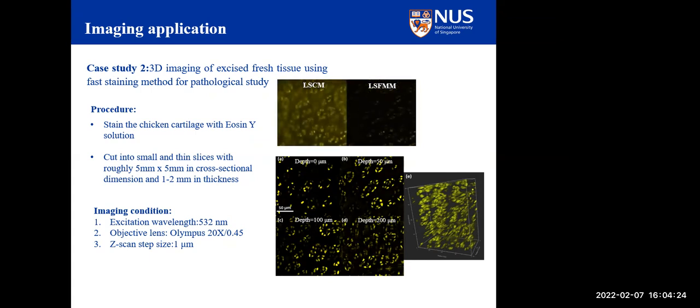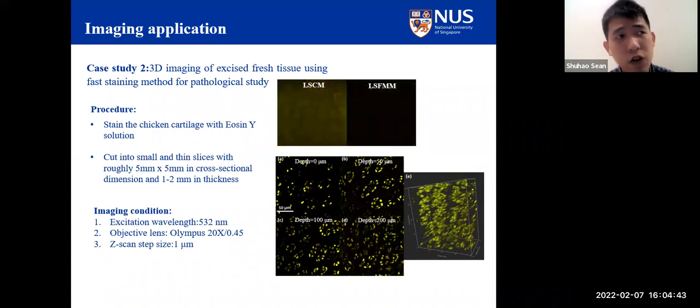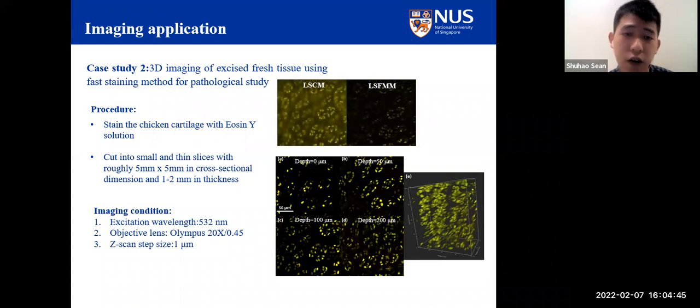So if, let's say, we bring a live sample, just fresh tissue, what is the depth of imaging that we can achieve? Will it be like 40 micrometers, for example, 50, based on your experience? Yeah, this depends on the scattering coefficient of these tissues.